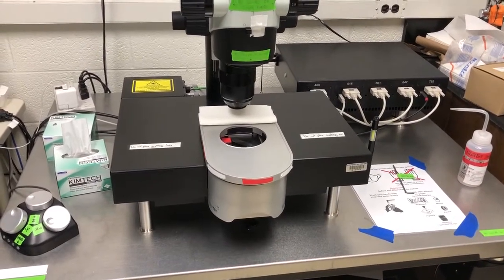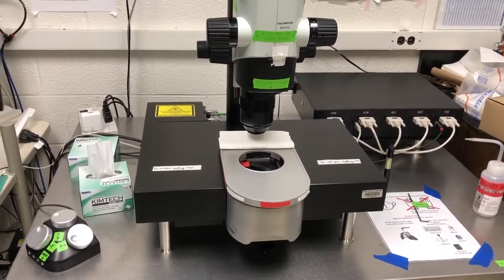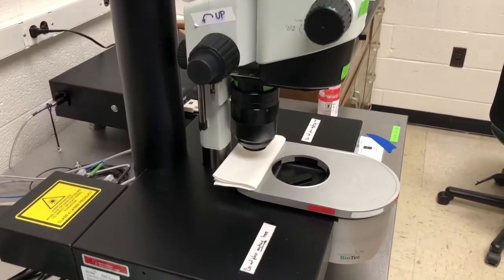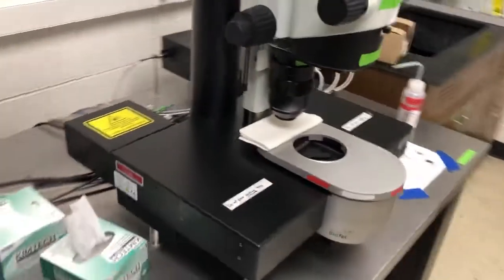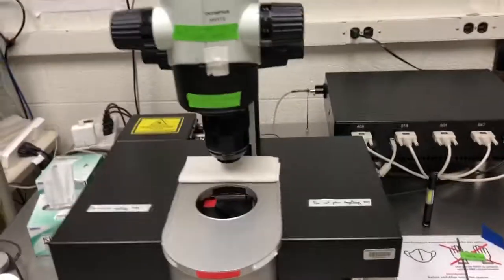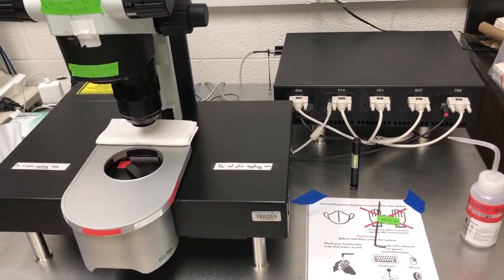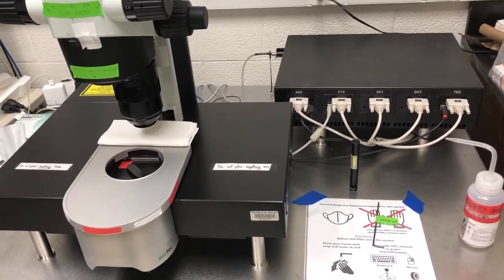If the sticker is green, then you should only touch that element with your bare hands. On the microscope table itself, there are only four things that you need to touch with gloves. Every other thing you should touch without gloves.